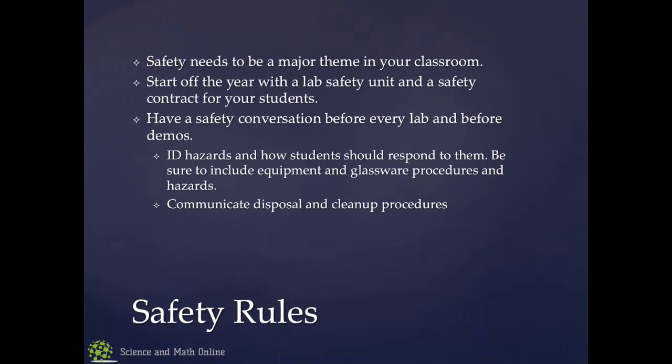This has to happen between every lab. Every lab you do, you've got to have this conversation. Never assume that the kids remember. Never assume that they know better. It's your job before every single lab to say something. Right?